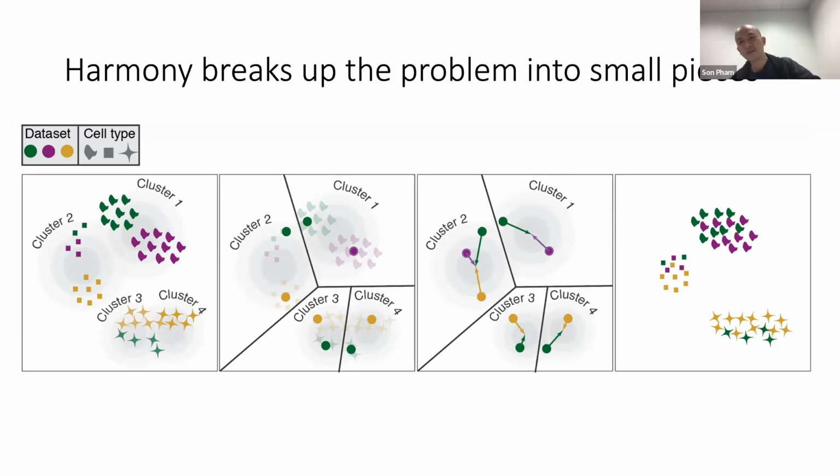And the next question from Nikolai. As far as I understood, to start the first iteration of linear batch correction, you need to know the nearest neighbor across batches that belong to the same cell population or cluster. What if the cells look like nearest neighbors because of the batch? In other words, if the gene expression variation due to the batch is not orthogonal to the biological variation, but collinear, how would Harmony or even MNN solve this?